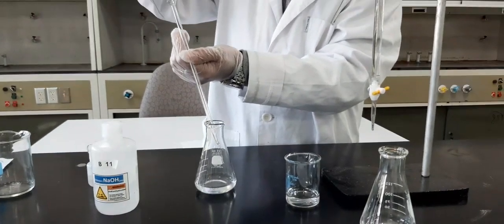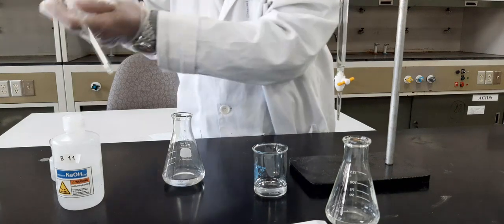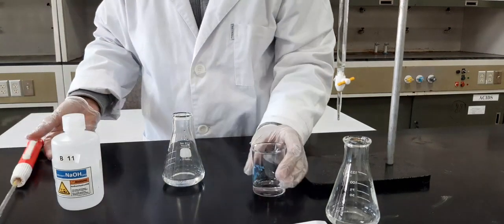Okay, it's been delivered completely. We have 2 flasks. If you have 3 flasks, you can have 3 different conical flasks. You will repeat the experiment 3 times.